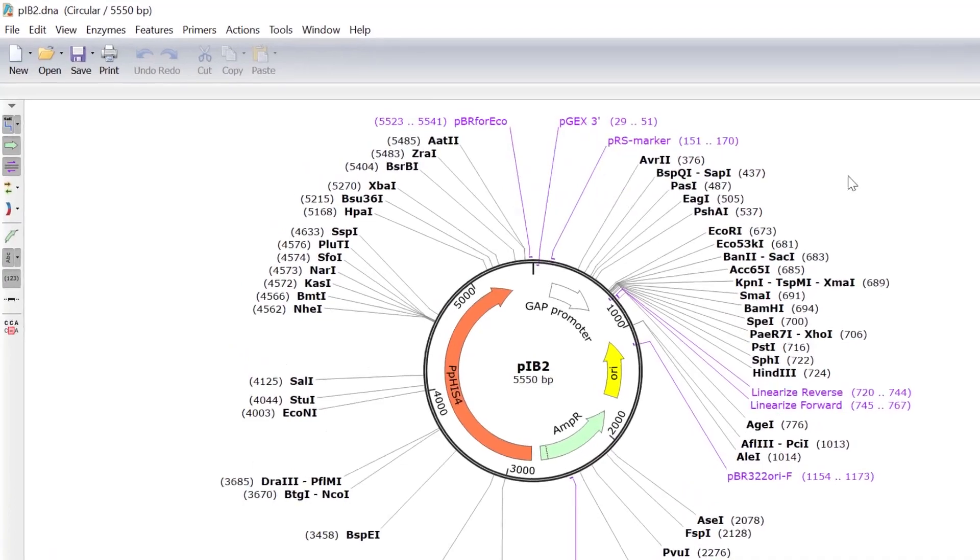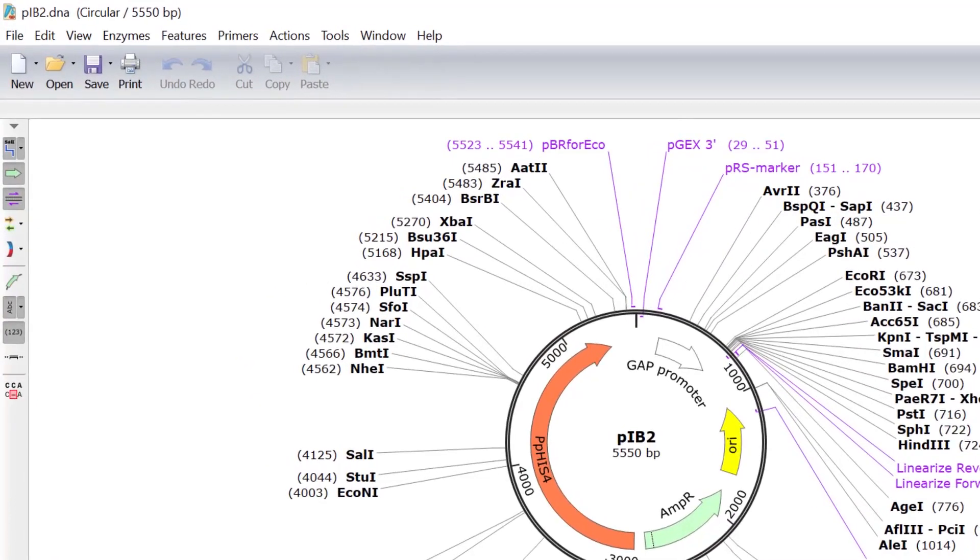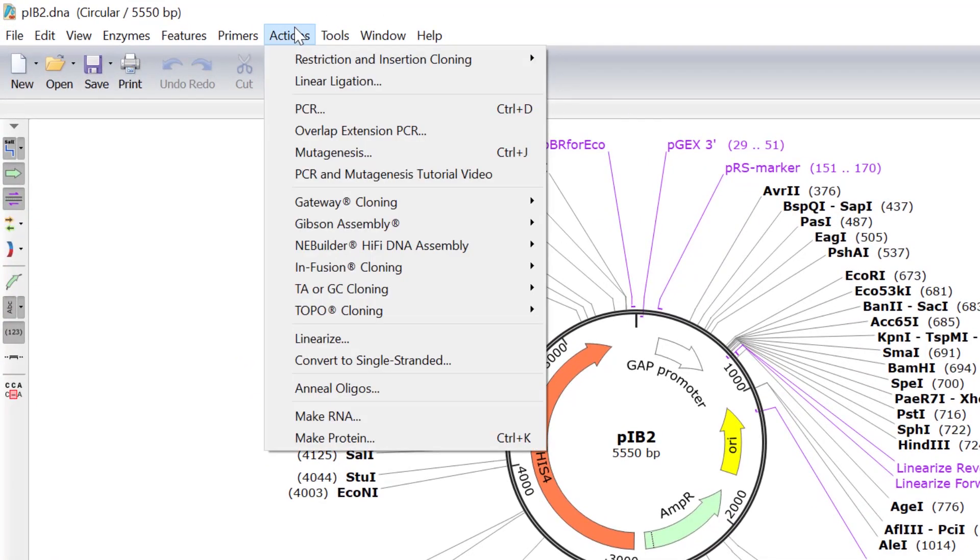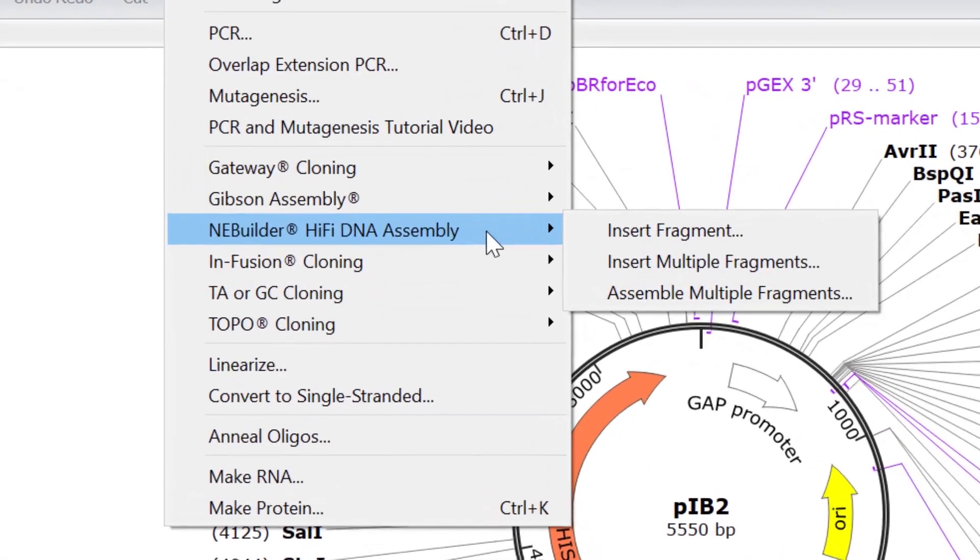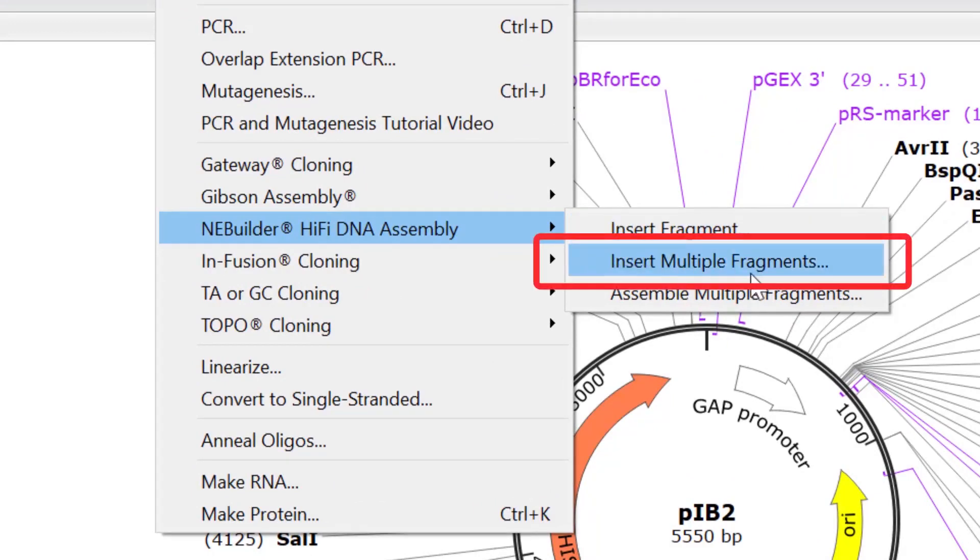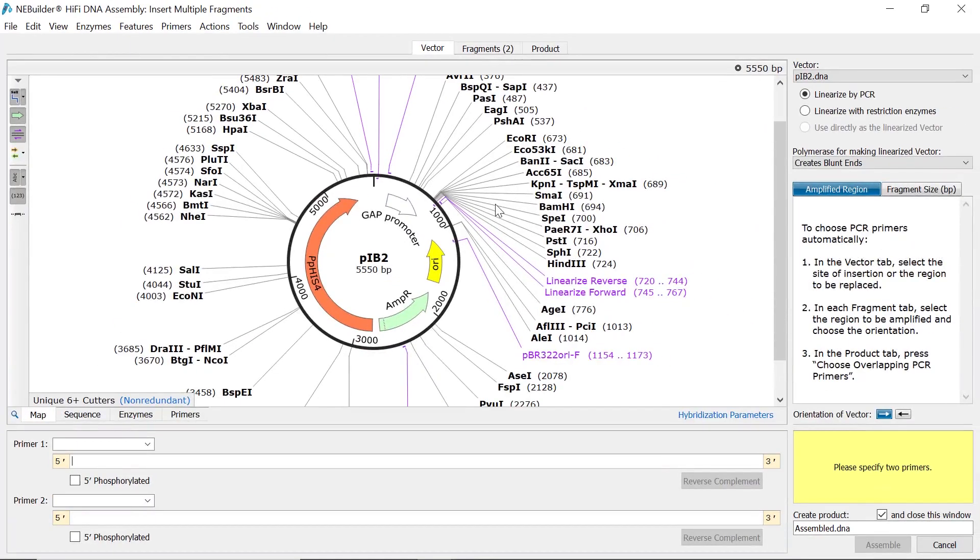To perform the assembly, go to the Actions menu. Then go to NEBuilder HiFi DNA Assembly and select Insert Multiple Fragments.